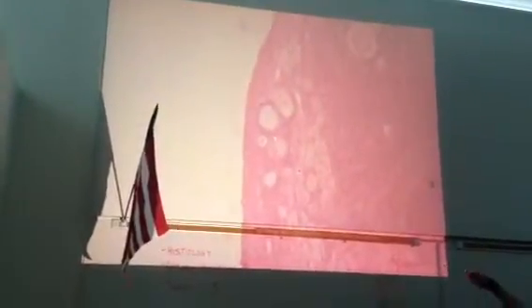And they develop into primary follicles, and the primary follicles look like these. And they have a layer of cells around them. Okay, so there's a primary follicle, another one. Again, as we talked last week, one only wants to ovulate one potential gamete, and fertilize it to have a single child.